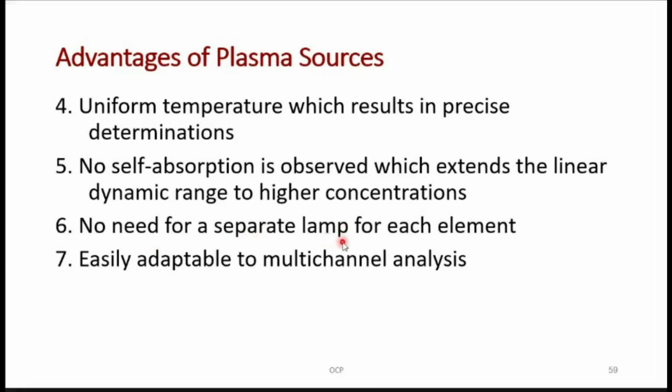No need for a separate lamp for each element. In conventional flame, many times a different mixture and different arrangement of the flame is required, so that the atoms that are produced will be able to absorb the electromagnetic radiation produced by the source.